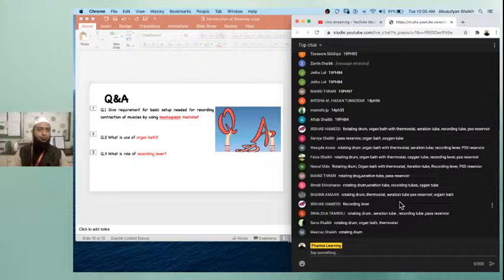Okay, fine. My next question is, what is the use of organ bath? Come on. We have seen the multiple uses of organ bath. What is the use of organ bath?